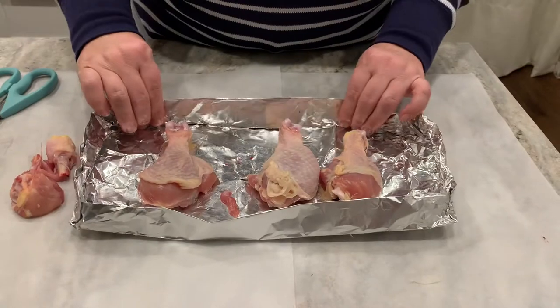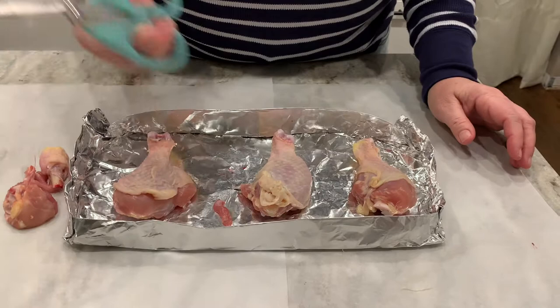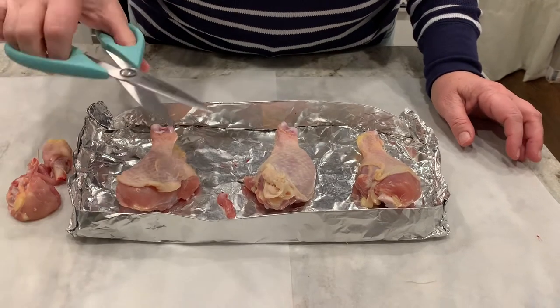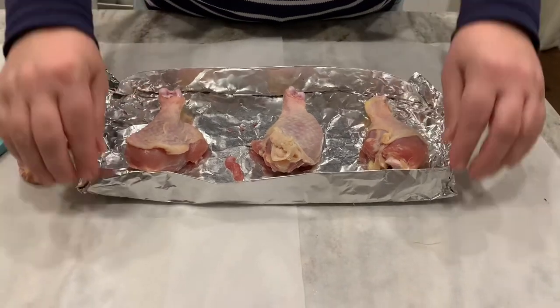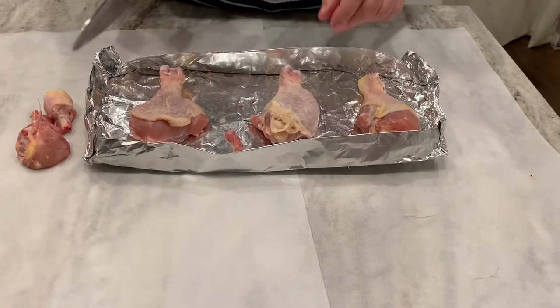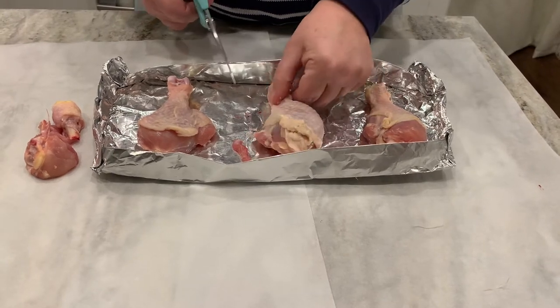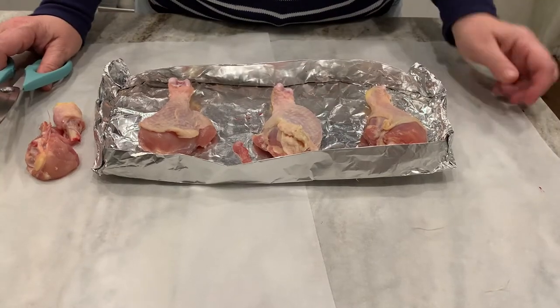After you make your tray, place your chicken leg into it. I'm using household kitchen scissors — you can use any type of scissor; you don't need a scalpel or a knife. With safety in mind, chicken legs can be slippery, so always cut away from your hand or body and keep it down on the tray as you cut.